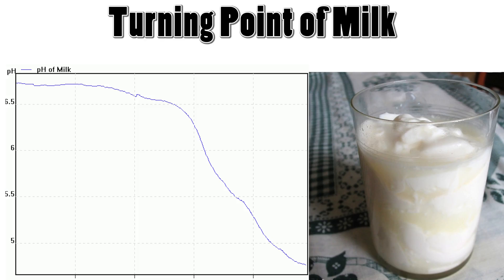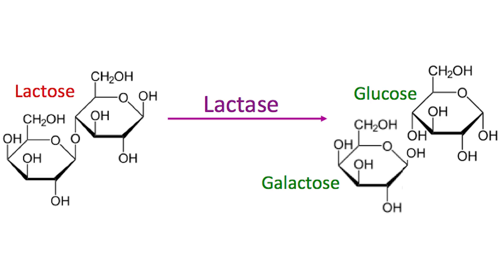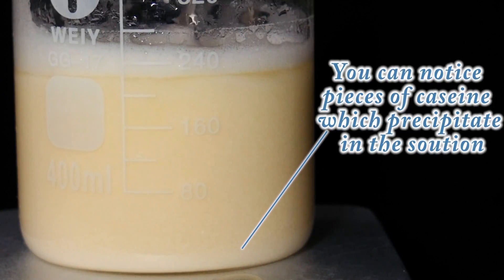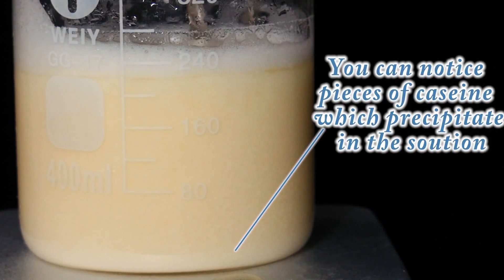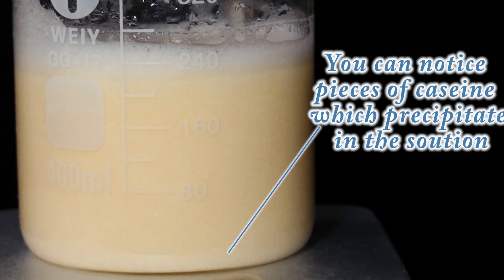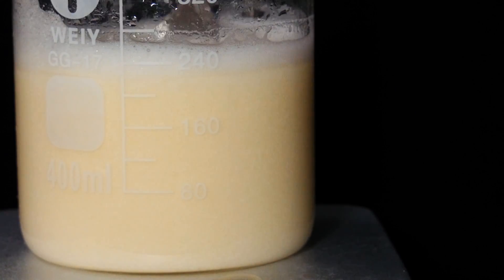We have now separated casein. Its solubility is pH dependent, and that's why we acidify the solution with a weak acid. It's important to know that we cannot use a strong acid because lactose tends to decompose when the pH is really low. We use acetic acid, which is a weak acid, and we obtain casein because its structure tends to precipitate when the pH is lower than neutral.